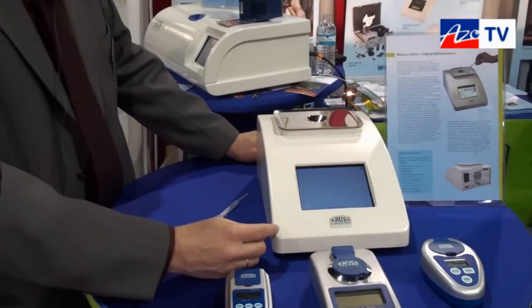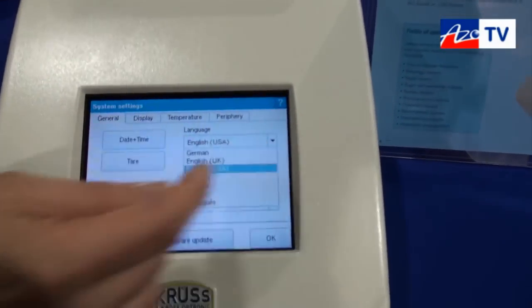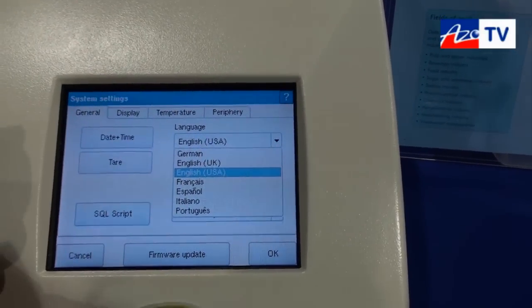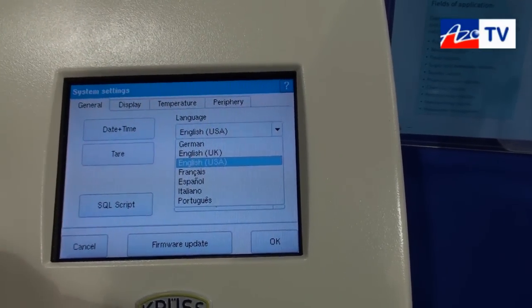In the system settings we have options for language and date. We have different languages available: English, German, French, Spanish, Italian, and Portuguese.